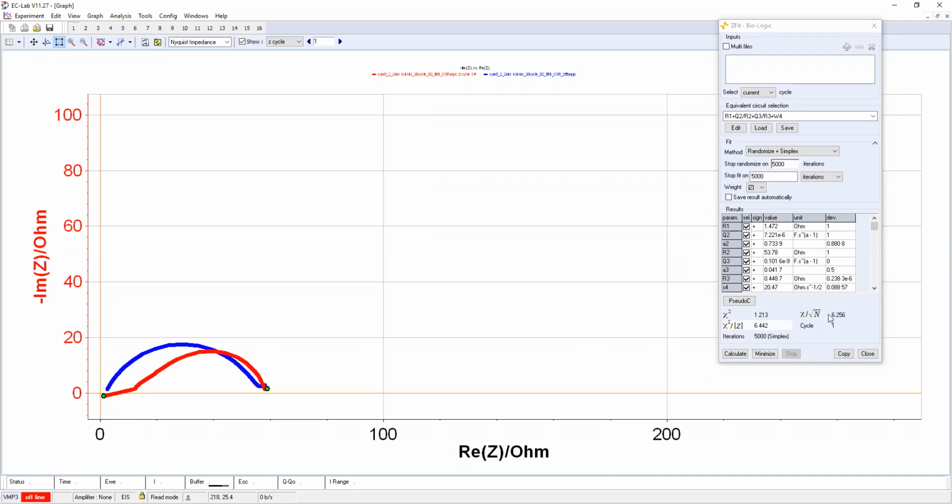So you will get the value. It should be below 1 definitely. And then how you select your resistance values. The three components R1, R2, R3. So you always remember the R1 value is the solution. The first resistance, R1, will be the solution resistance.